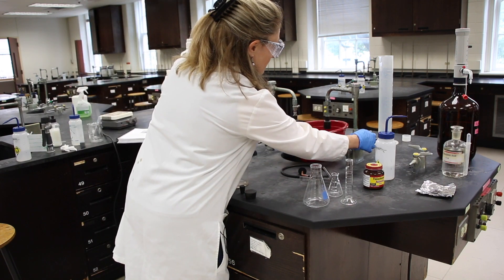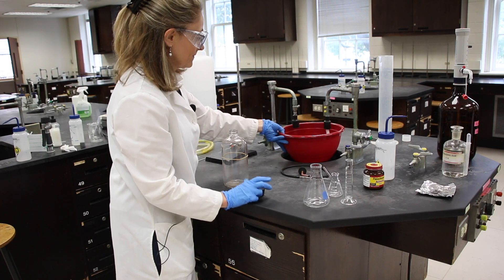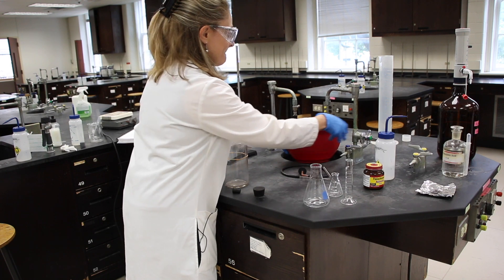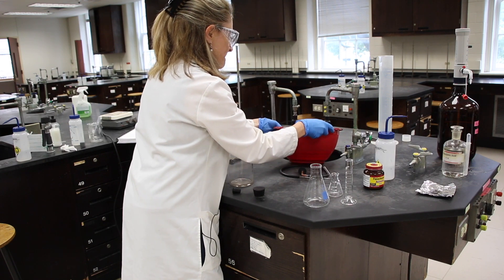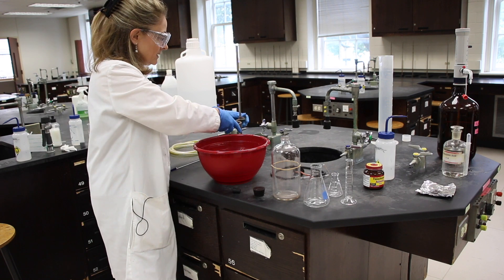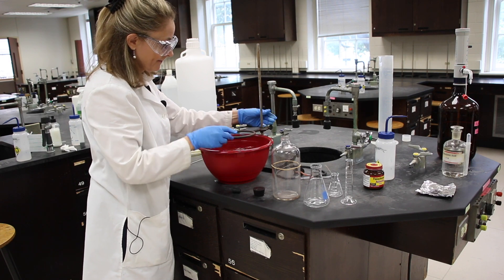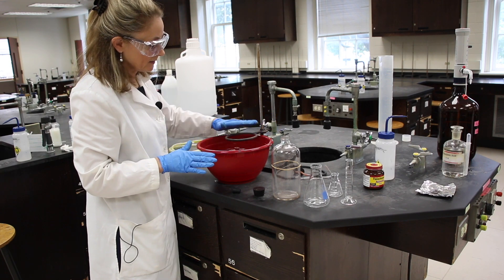We're going to be filling this bowl to about 1 inch from the top with tap water. Then we're going to turn this ring stand around so that the ring is over the bowl of water, and we're going to move and clamp the ring so that the clamp is right on top of the rim of the bowl.